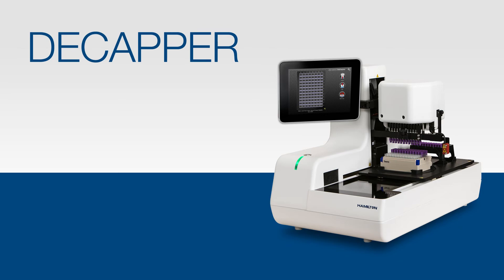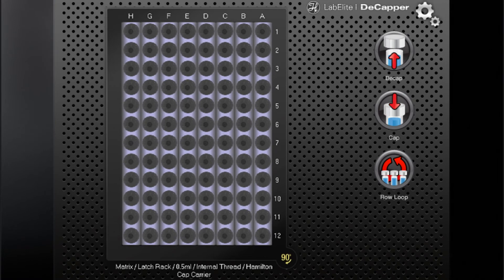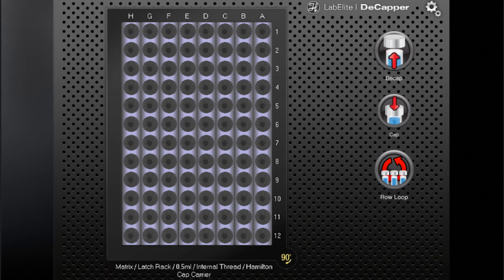Let's take a quick tour of the touchscreen. This is the system settings button, used for changing heads, adapters, or labware. Here are the decap and cap buttons, the row loop button, and the 90-degree button to select landscape or portrait mode.